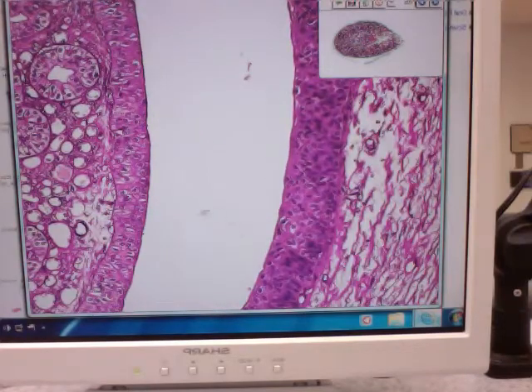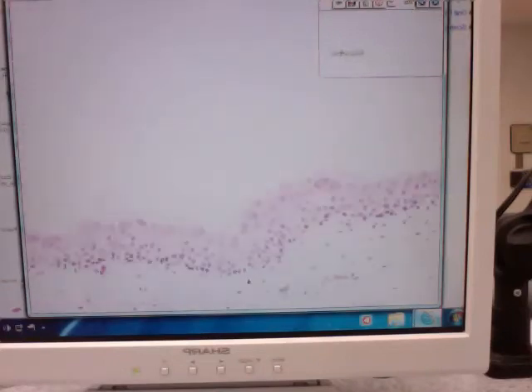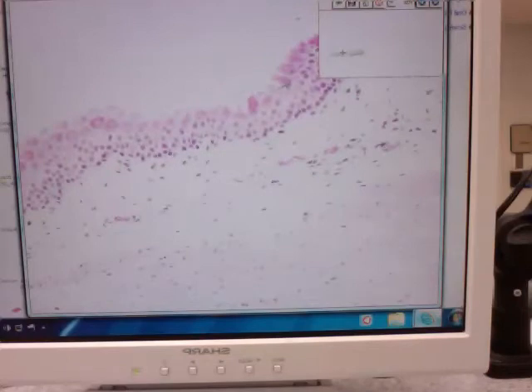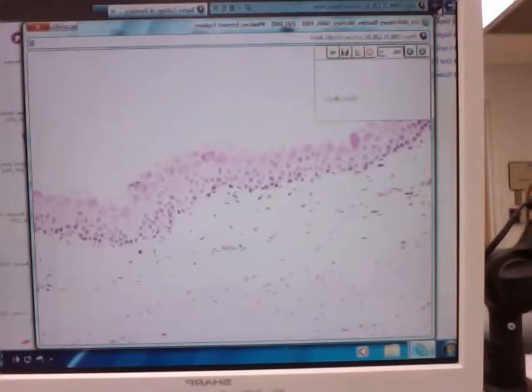We probably didn't make you learn it here, but I'm going to do it to you. Okay. Here we see an epithelium that is multiple layers in thickness. And what is the shape of the outermost cells? Really strange. Big old puffy balloon-shaped cells. You can call them whatever you want, but this is an example of transitional epithelium.